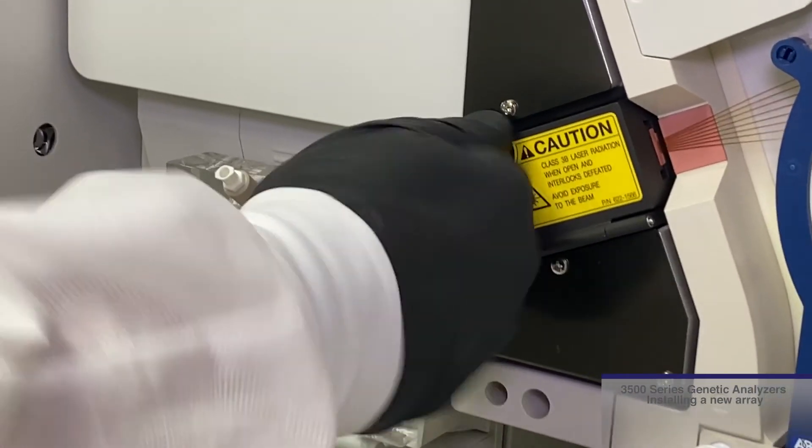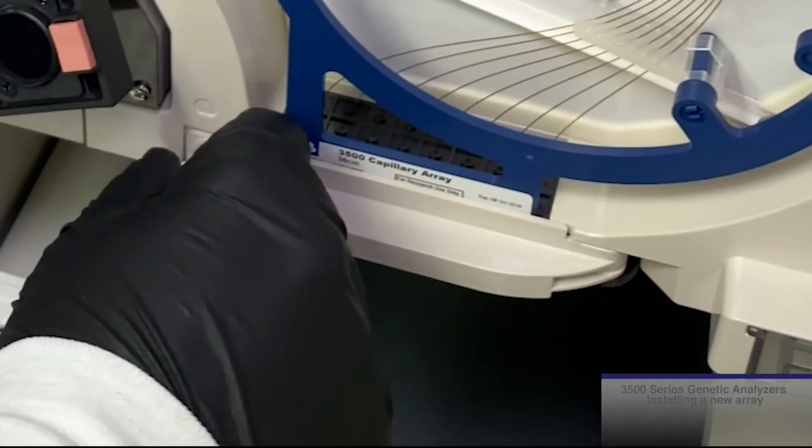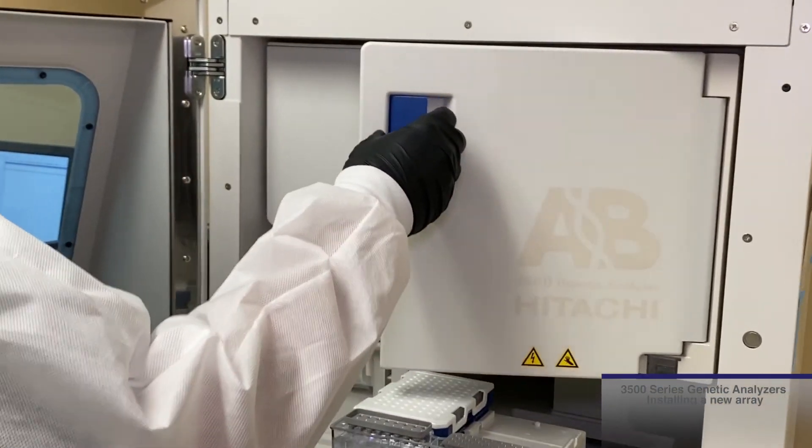At this point, ensure that all three points of contact are tightened and closed: the array tip, the detection cell block door, and the array latch header. Close the oven door and then click Next on the computer.